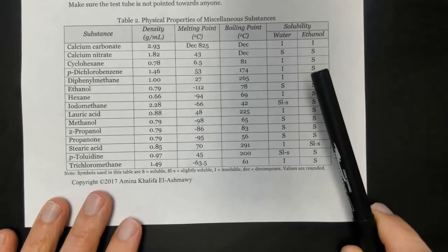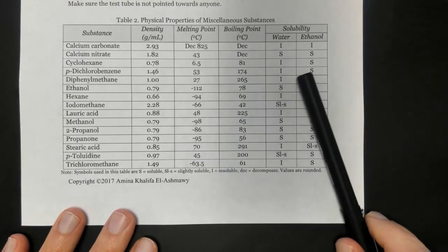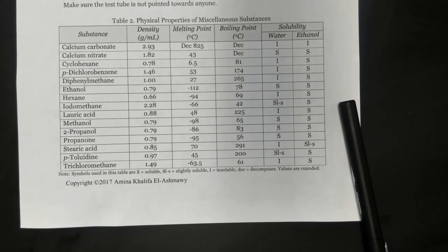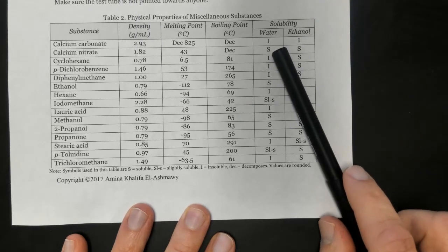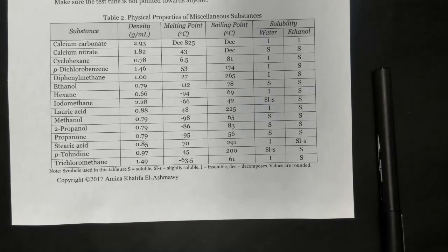I want to mention something over here, the solubility. We're going to be placing the solid into water, and we're going to be placing the solid into ethanol, and we're going to decide on whether it's soluble in either one of these. So I means insoluble. S means soluble.